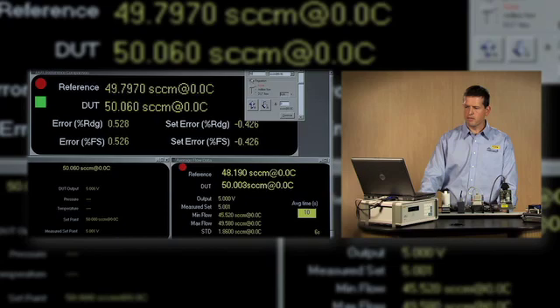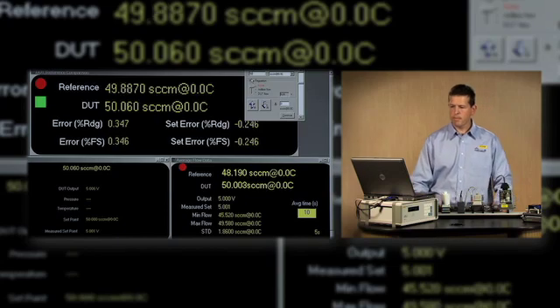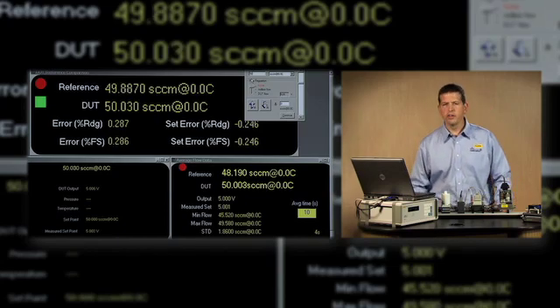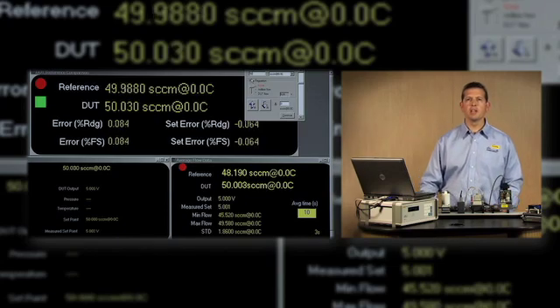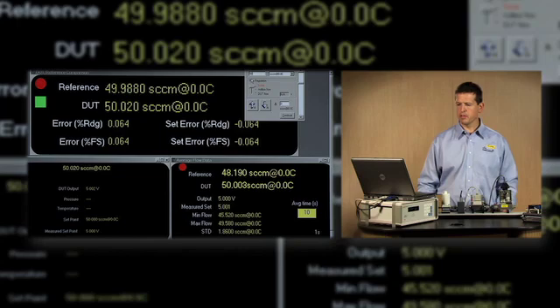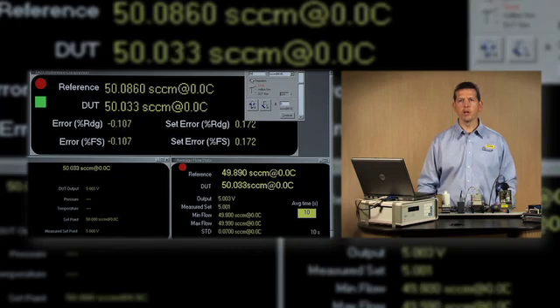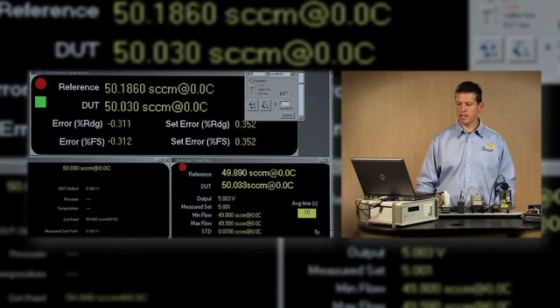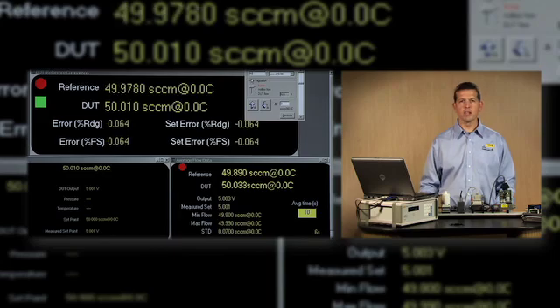After we're satisfied that we have all our adjustment points in tolerance, then we can go back to Compass and rerun our automated test like we did in the beginning and gather data to be sure that our as-left condition is in tolerance on the MFC.